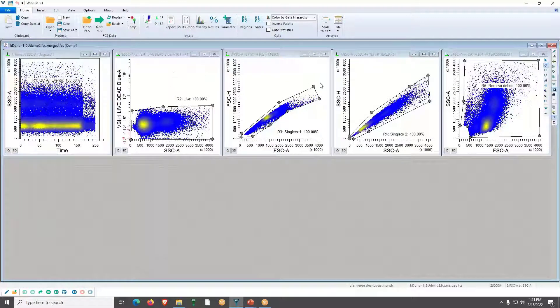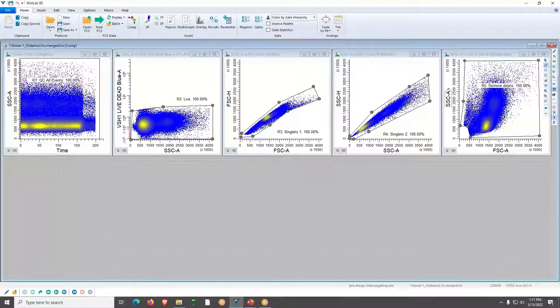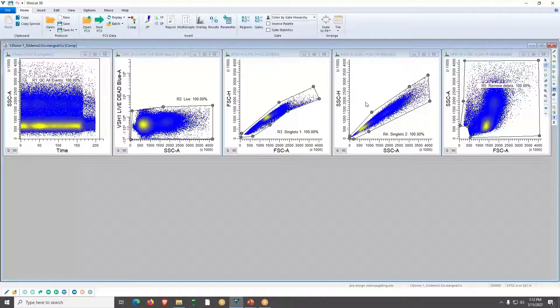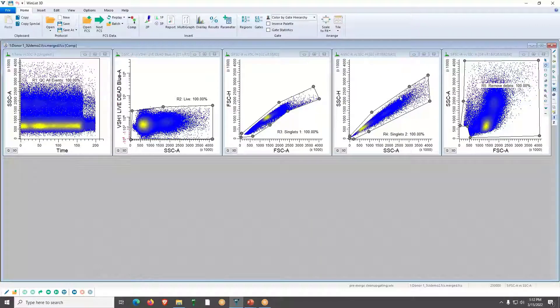Now you can see the display has changed. It has merged the files with that gating hierarchy — we have live events, singlets 1 and singlets 2, and the debris has been removed. All of these are displaying the five merged data files. Next, I'm going to set up a 1P histogram with the File ID so we can use that for gating.